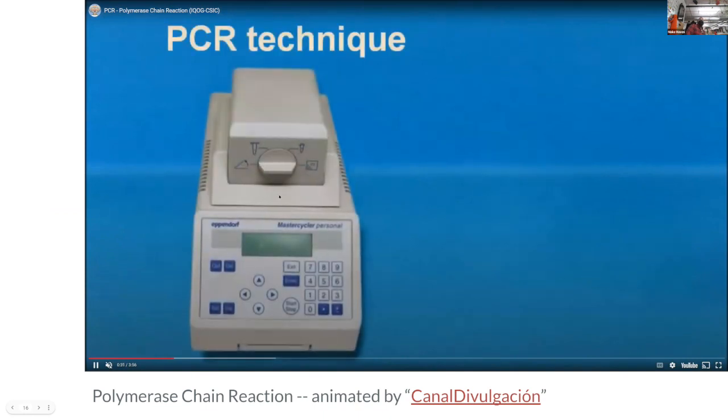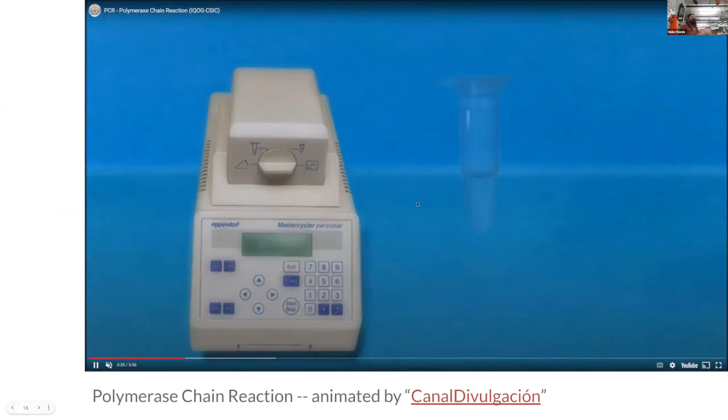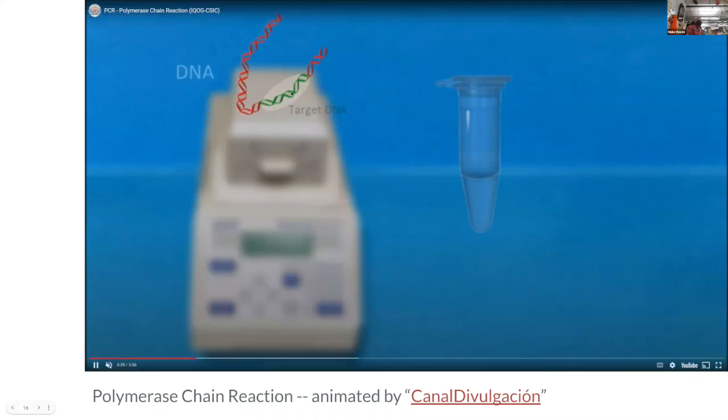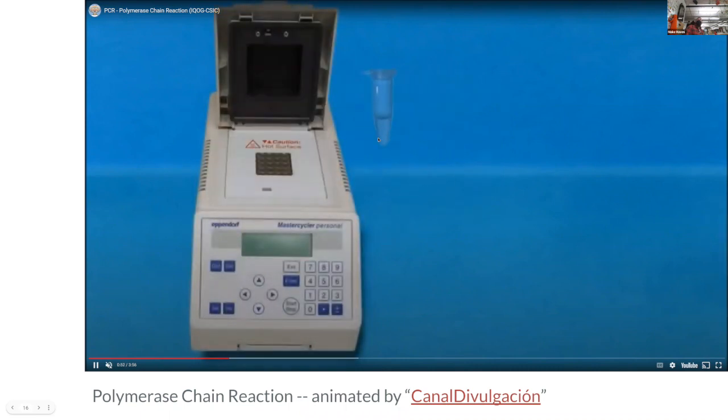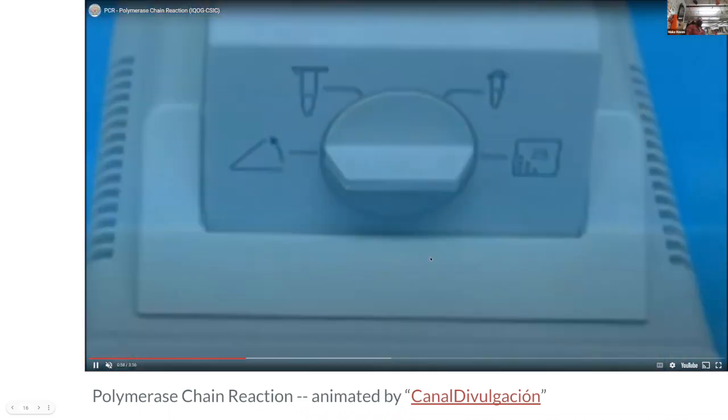So the PCR technique is going to be to take this thermal cycler. It's going to help this all go through in the way that it needs to, where you can go through and find some target DNA. When you take your sample, we're going to apply a chemical that'll help you find exactly what you need. And then we're just going to sort of zoom through. All of it's going to happen inside this little teeny tiny pipette, or tiny little tube. So that little tiny tube goes into here, and that's where the magic happens.